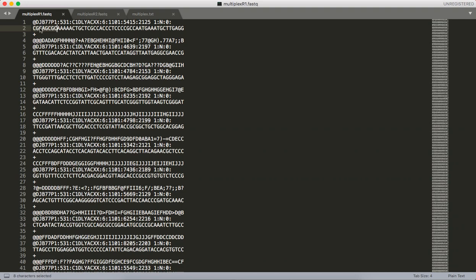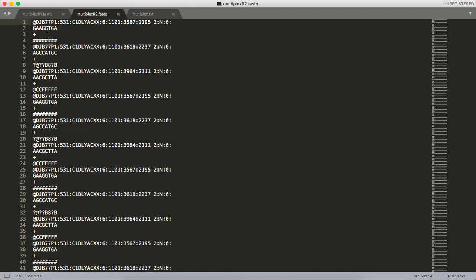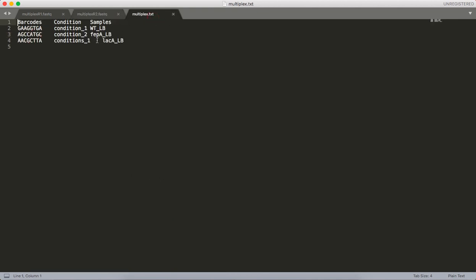Then, for each read in this file, there's a corresponding barcode in the file suffixed by R2. The barcode file looks very similar to the reads fastq file, except the sequence is usually between 8 and 12 characters. This is simply the identifier that is attached to each of the reads of the R1 file. However, this identifier is not very human readable, which is why we have the sample map. This particular sample map corresponds those 8-character barcodes to actual sample names, and it's delimited by tabs.